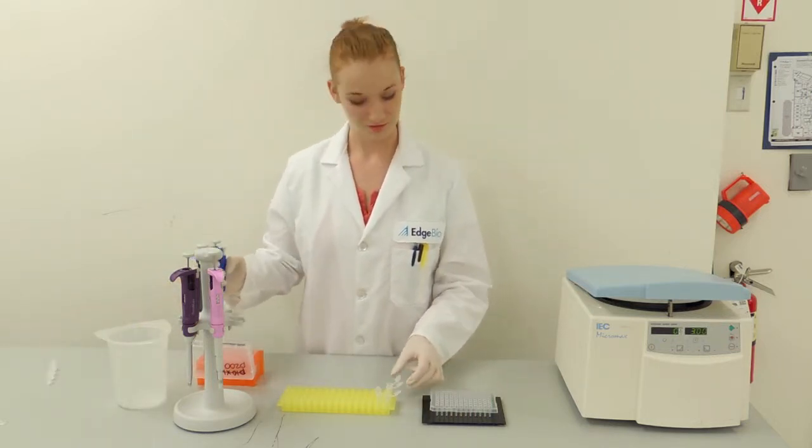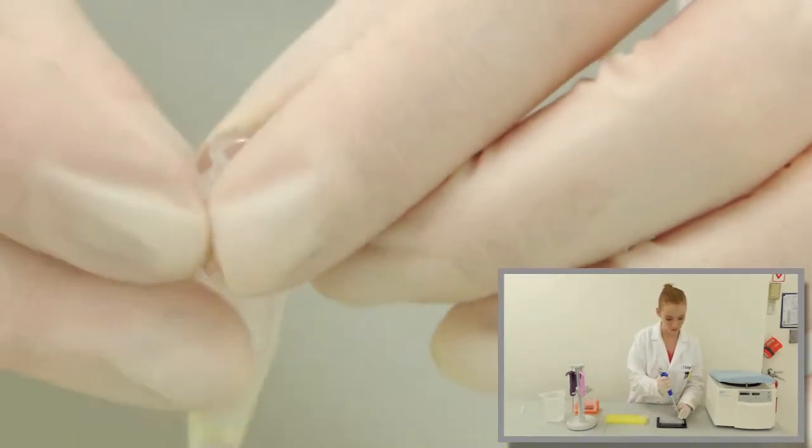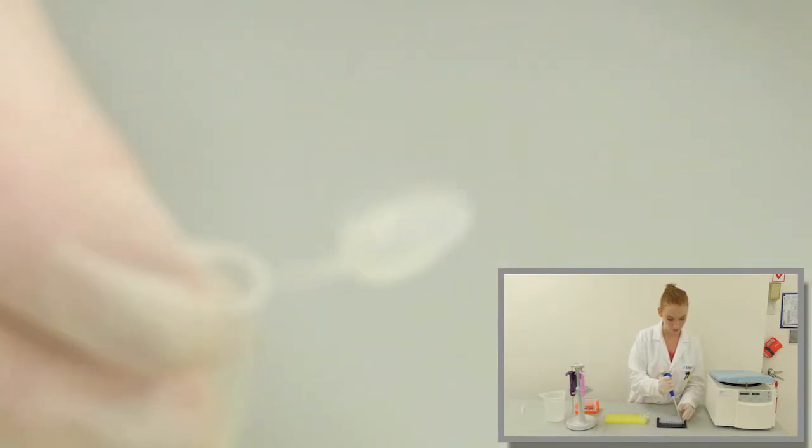For those of you that have multiple samples, the ability to individually label each cartridge helps to avoid any risk of confusion or mix-ups.